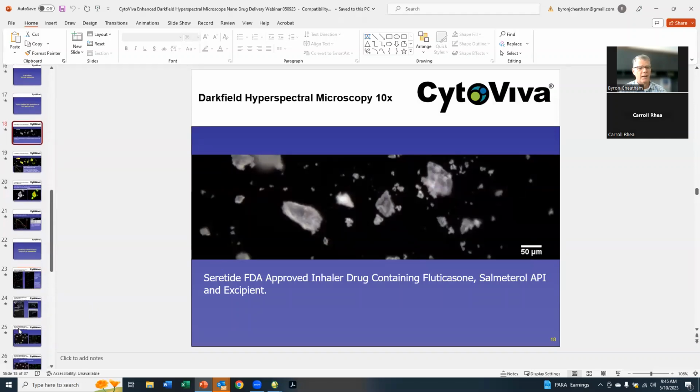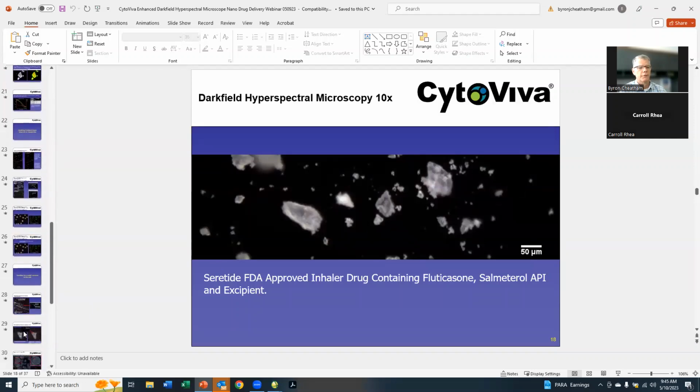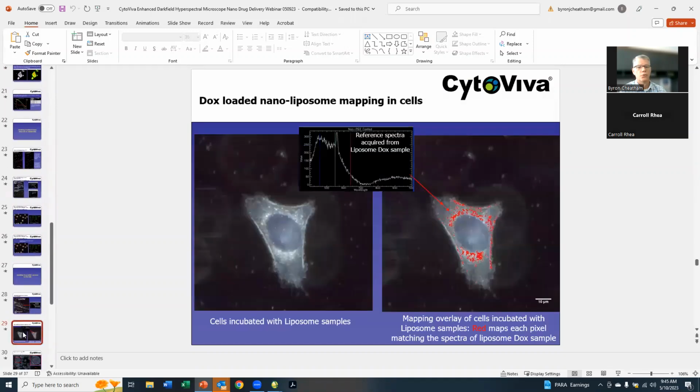If I look at a larger field of view, of the cell structure, maybe a minute and a half or 2 minutes to capture this area. So relatively fast, especially if you think about other spectral techniques such as maybe Raman or FTIR, and some of those related techniques. This is lightning fast compared to those. So that gives you some insight.